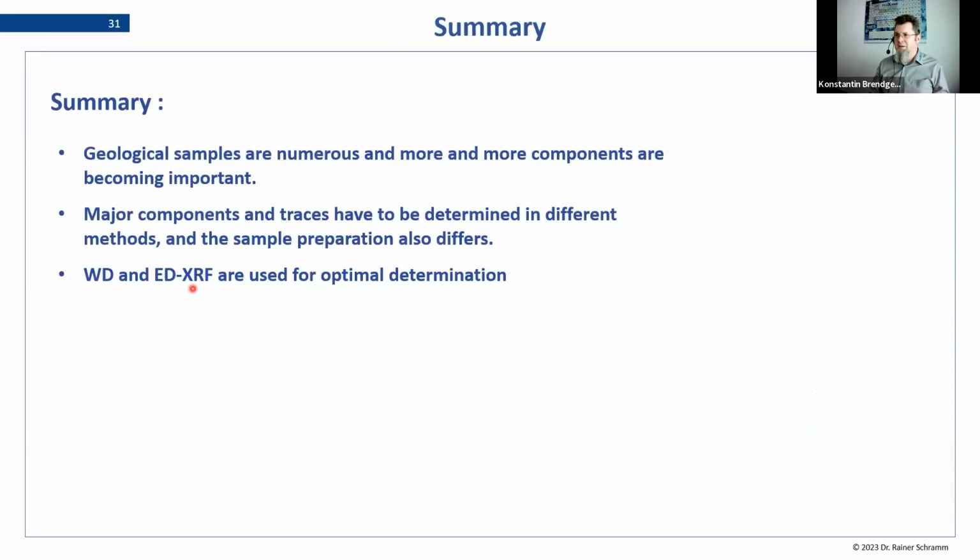So to summarize the whole analysis of geological samples as we do them here at FLUXANA: the application itself is developing all the time. There are always more analytes coming, and also new ranges of existing analytes that get interesting. So in order to analyze these to the best extent we can, we came up with this two-split method. We do a double preparation.